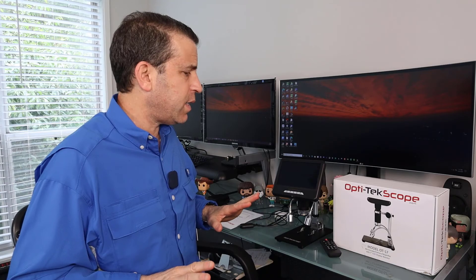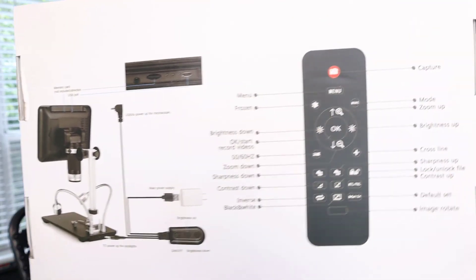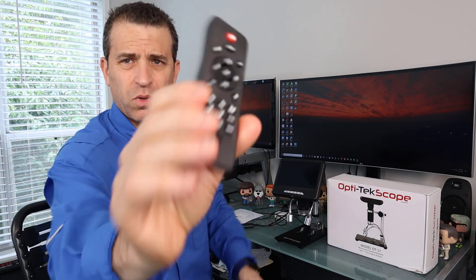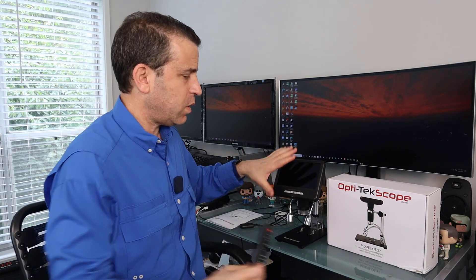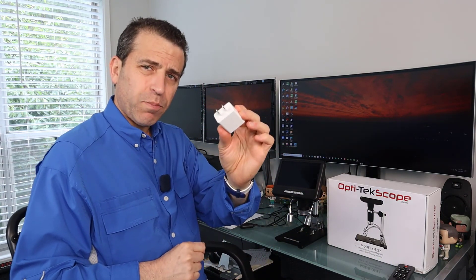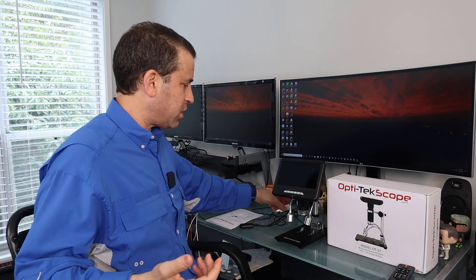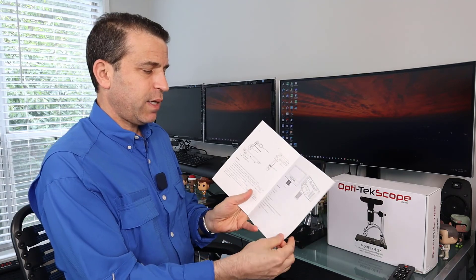Let's go ahead and dive in. Obviously you've got the box — it's got a lot of good information highlighted. You can see it includes a remote control, which you can use, but I find you can also easily just use the microscope itself. For power, you can use the plug with a USB connection or just go directly to USB power. You also have the booklet, which does highlight information.